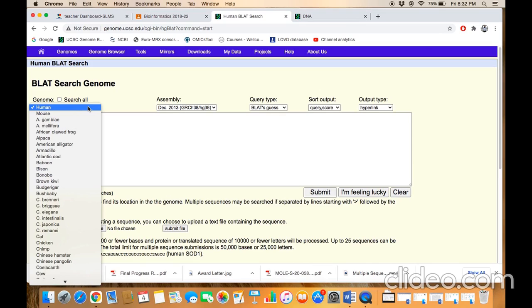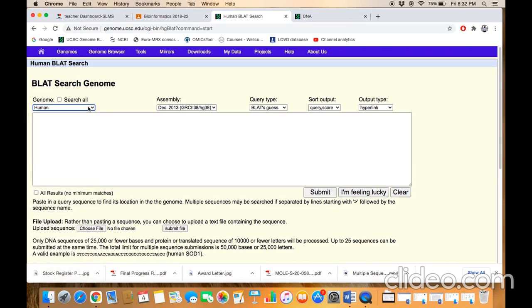On the parameter page, you need to select the species, or which genome assembly you are looking for, and leave the other parameters by default.